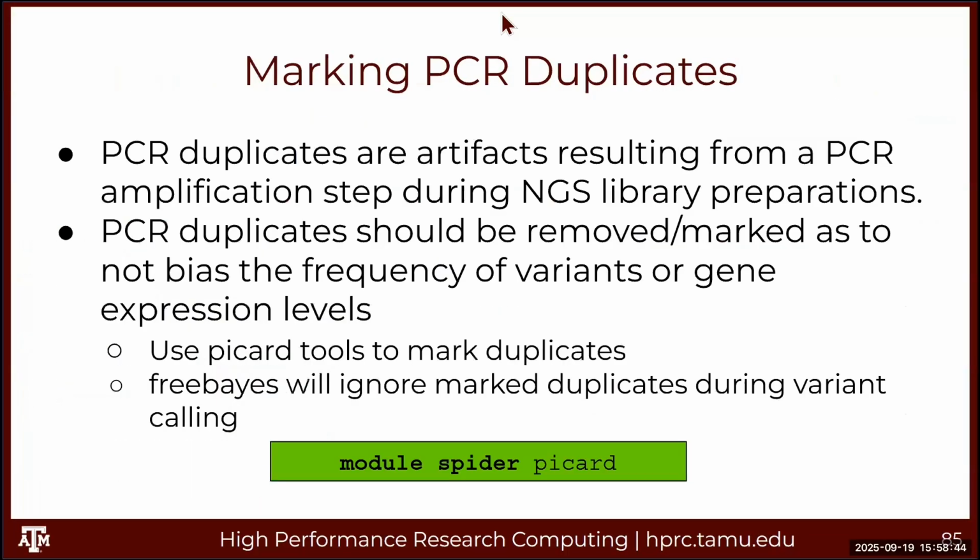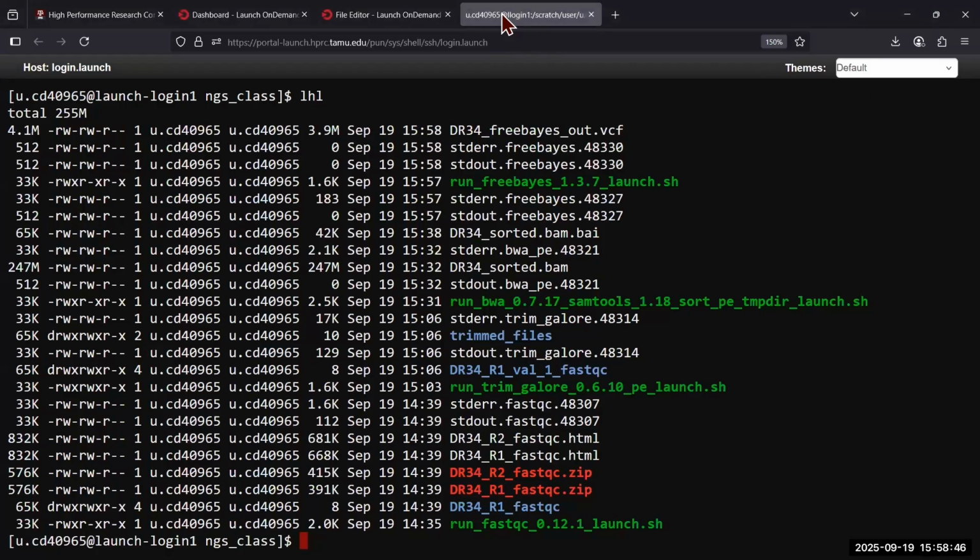Okay. Did everyone get the job running? You did? Did you get the job running? What about your job? It's crashed. Space. Are you? FRE, and then Q, enter. It's running. Okay, so it takes a few minutes to run. So we got a minute left, maybe.